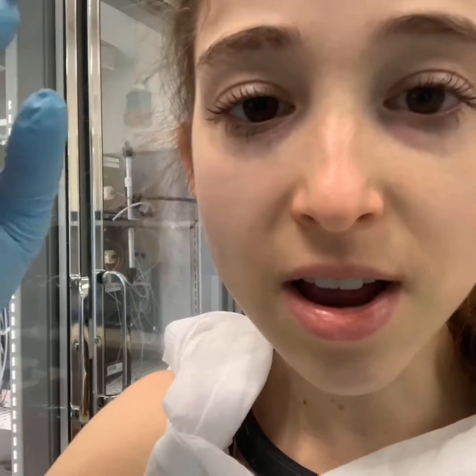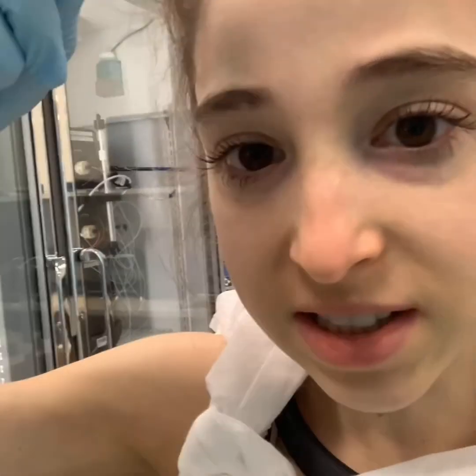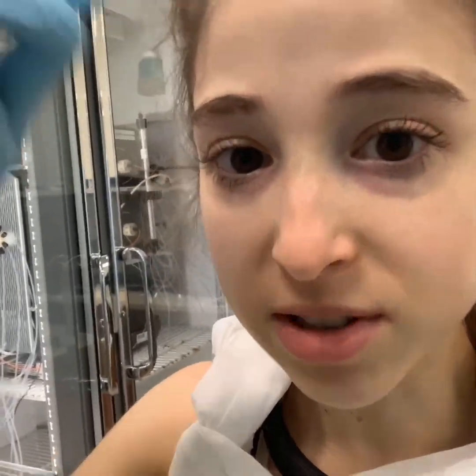That column is filled with these little beads called resin, and the resin has all these little tunnels in it. The bigger proteins can't fit into those tunnels, so they get to take shortcuts. The smaller proteins have to go through all those tunnels, so they take longer. And so the proteins will separate based on their size.